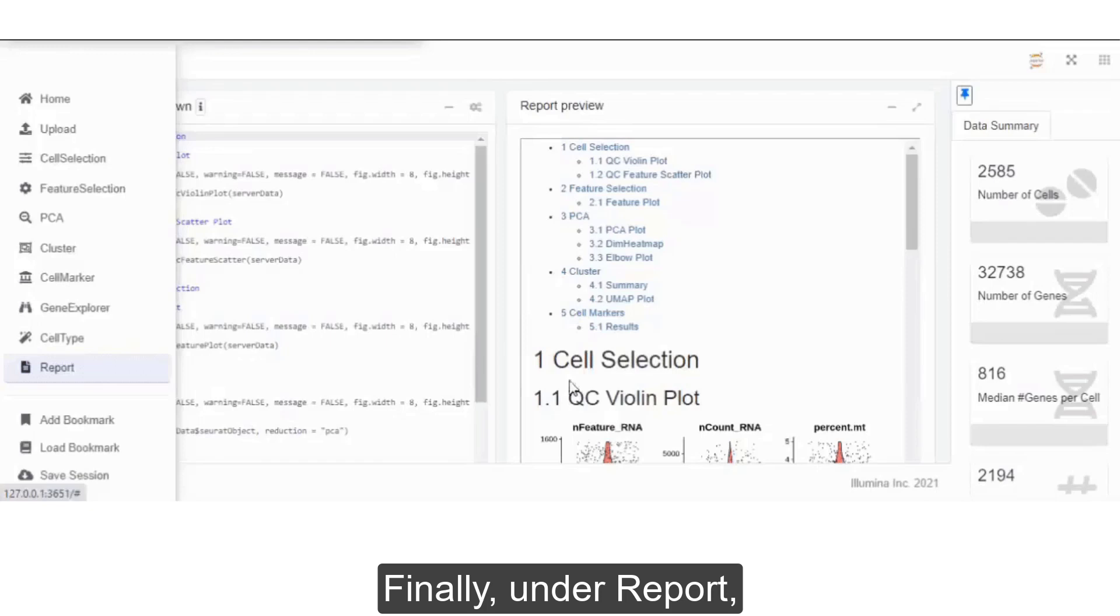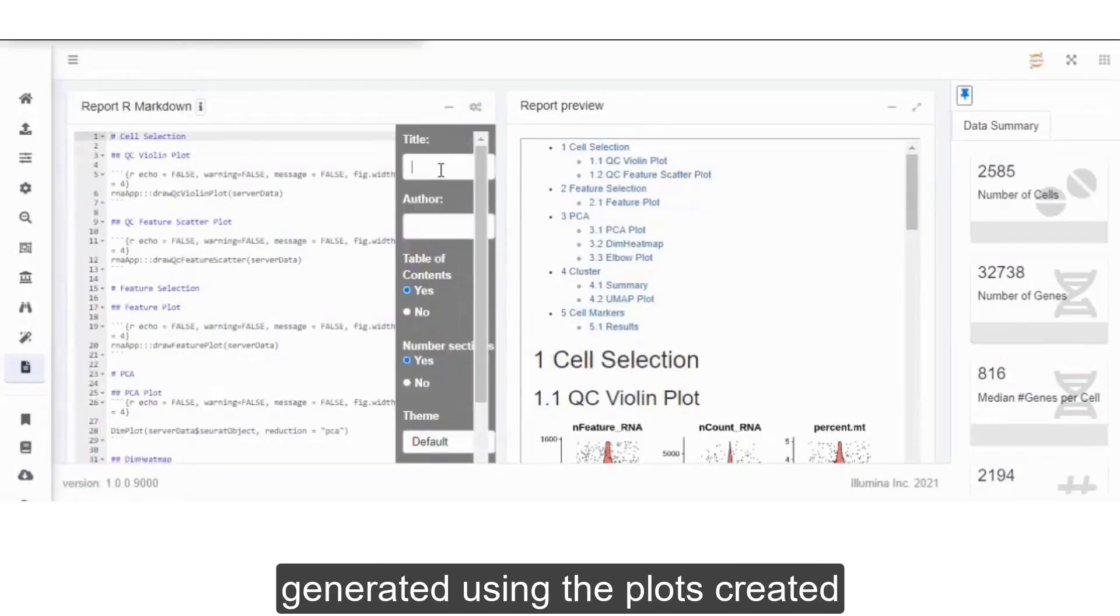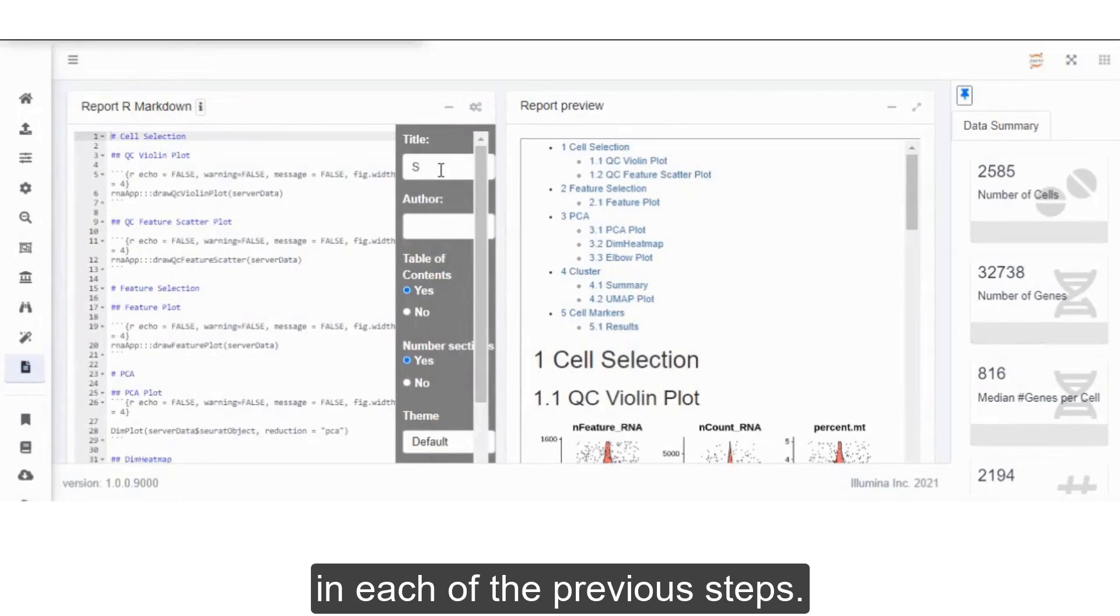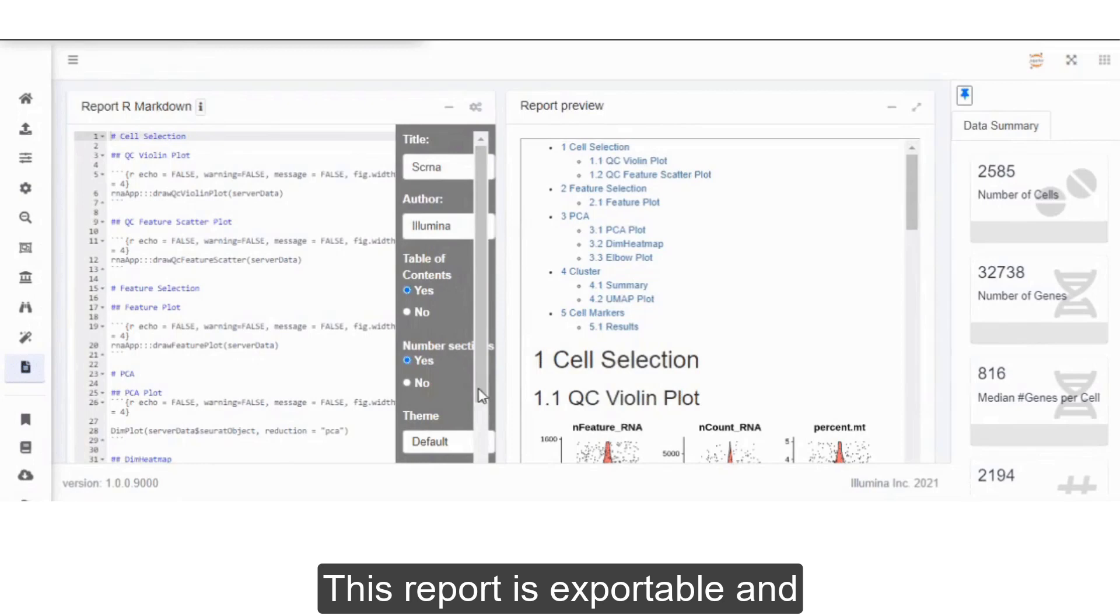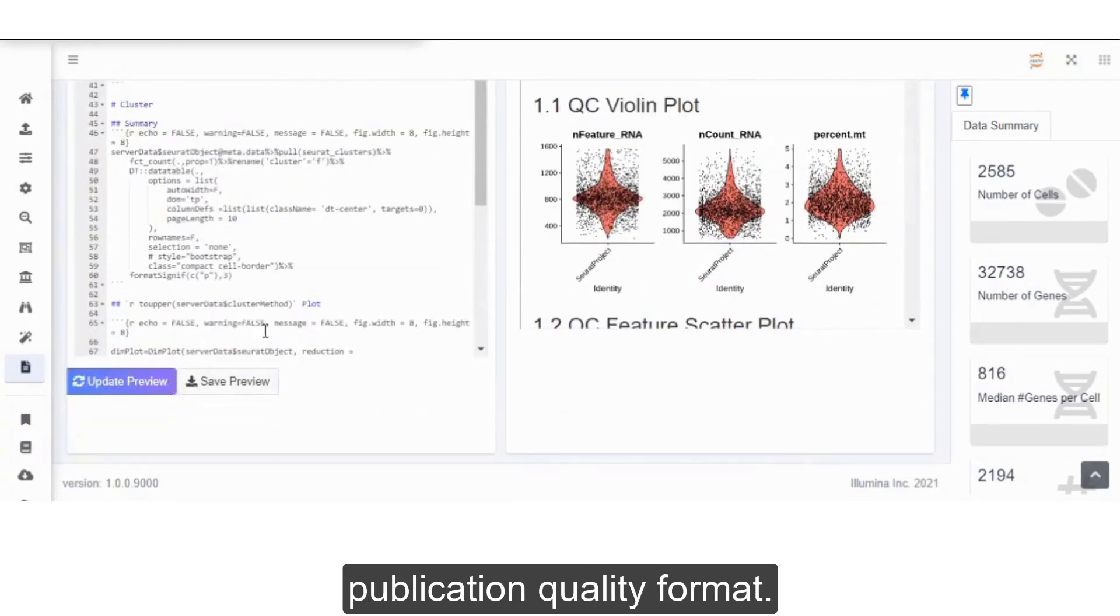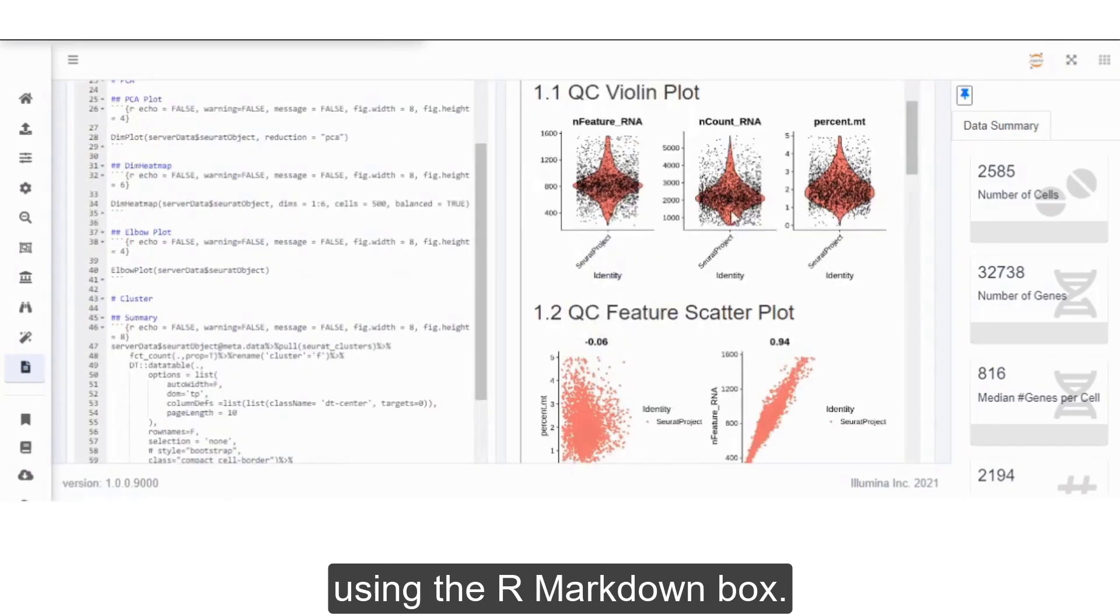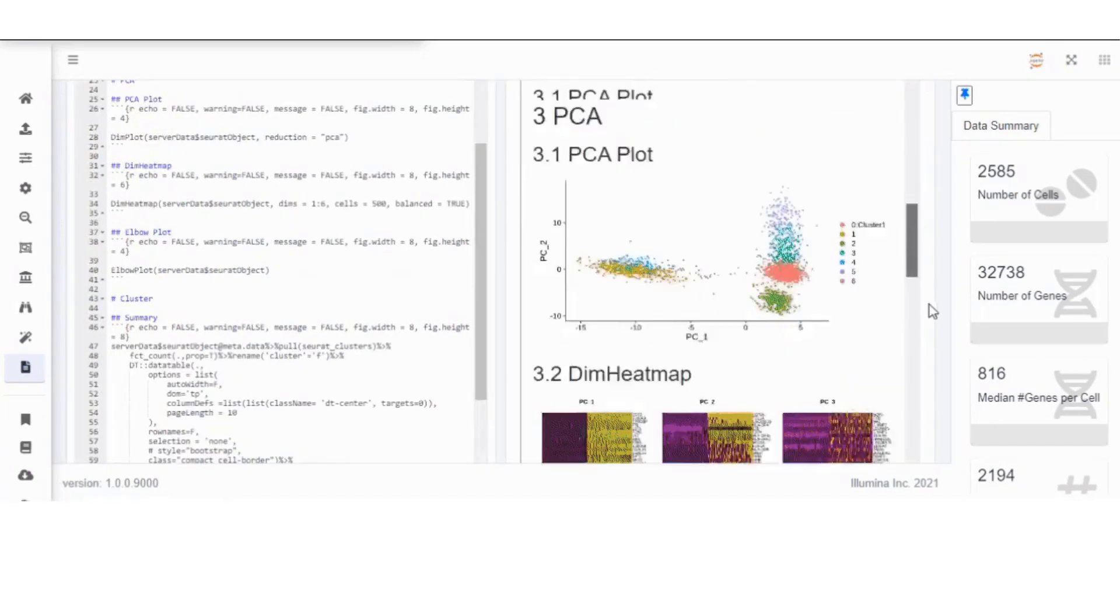Finally, under Report, an HTML report is automatically generated using the plots created in each of the previous steps. This report is exportable and includes each of the plots in publication quality format. It can also be edited using the R Markdown box.